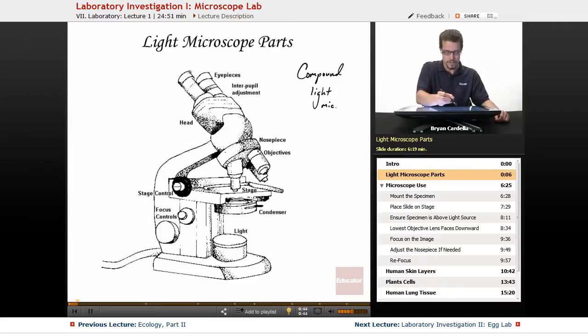If we start from the top going on down, you look into the eyepieces. Sometimes there's one, so you would close the one eye and look in with the other, and sometimes there's two. Oftentimes there's this interpupillary adjustment, meaning you can adjust the eyepieces. Sometimes you can actually spread them farther apart or closer together. You can also rotate the little edge of the eyepiece, which is a minor focusing. Now the eyepieces by themselves is times ten. So if you just had the eyepieces and you're looking at something, you're magnifying that object ten times.